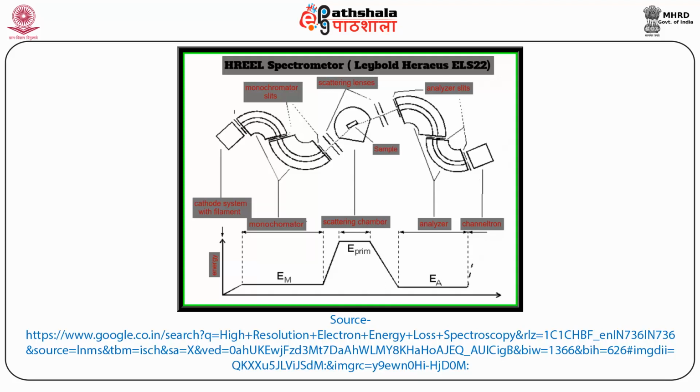The lenses are, in contrast to those of the emitter system, mounted and very flexible, as it is important to get a good focus on the sample. To enable measurements of angular distributions, all those elements are mounted on a rotating tabletop with the axis centered at the sample.